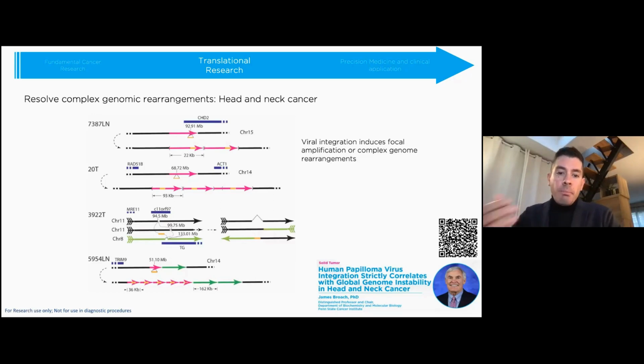So the take-home message here is that having single molecules of hundreds of kbs to entirely reconstitute highly rearranged loci opens the possibility completely out of reach of long-read sequencing, whether it is to make sense of NGS data, to find new SVs or biomarkers, or to assemble complex structural signatures. But how does it apply to the field of precision medicine? This is what we will discuss in the last part of this workshop.